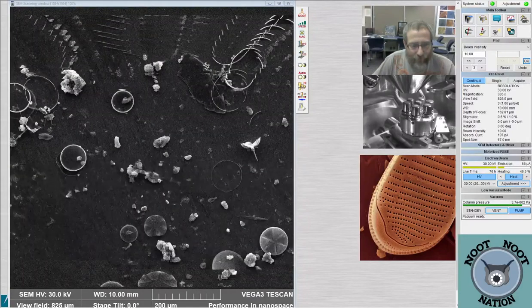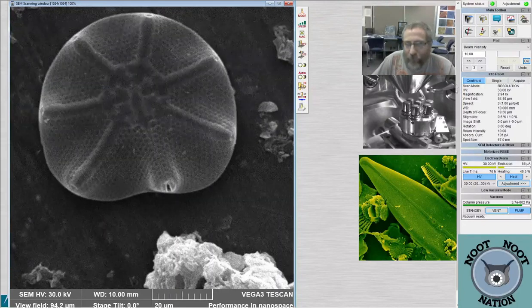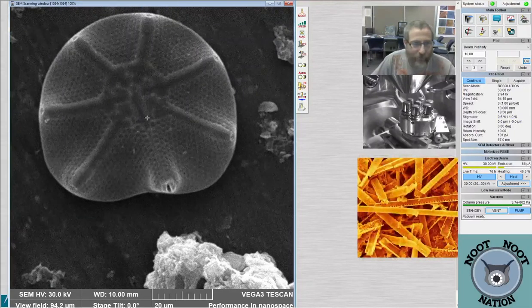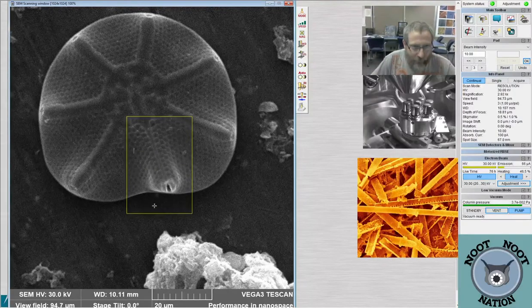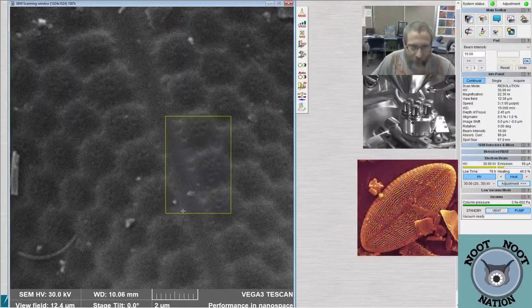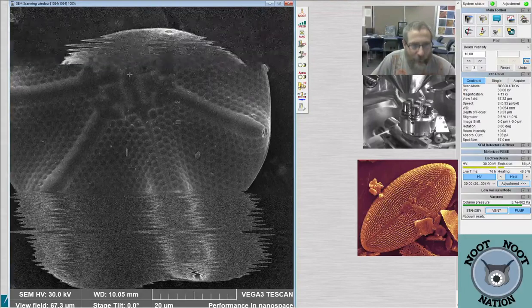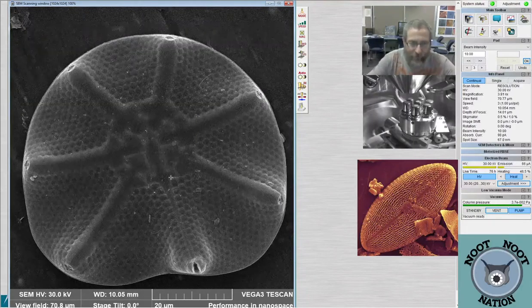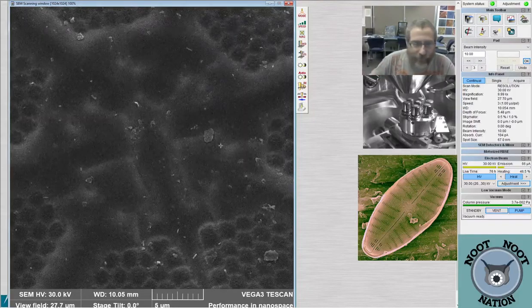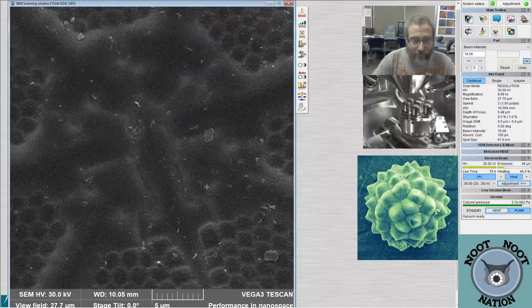It moved the sample a little bit when we did that, but if you look at the working distance, now our depth of focus is 18 microns, and I could then get this into focus, even zoomed in relatively closely, and the entire diatom will be in focus when I zoom out. Even when I zoom in relatively close, the depth of focus here is 5 microns, and nothing in our field of view is 5 microns difference in height in Z, right?